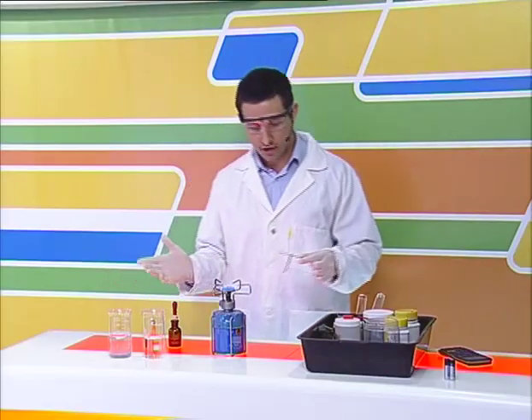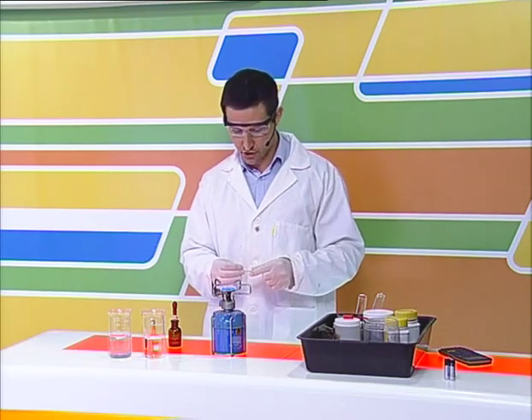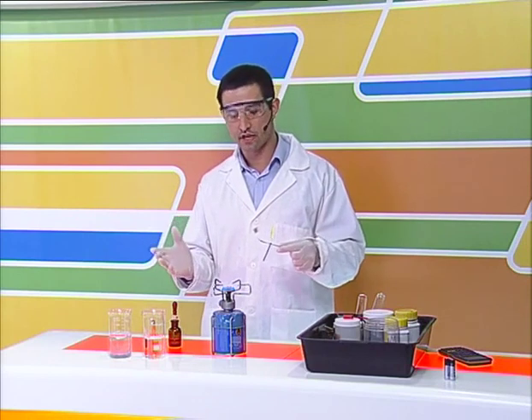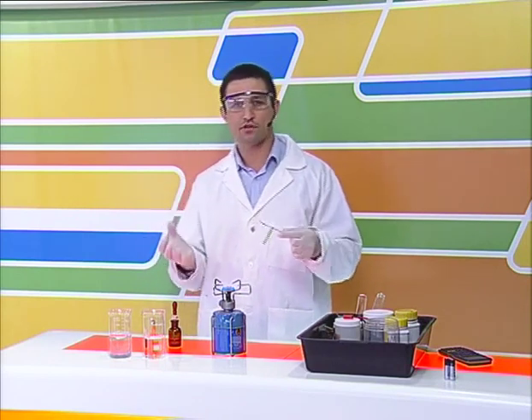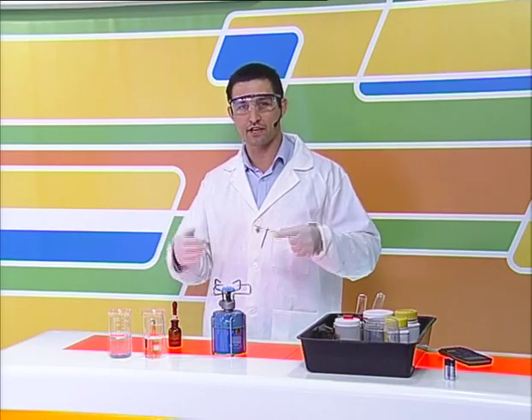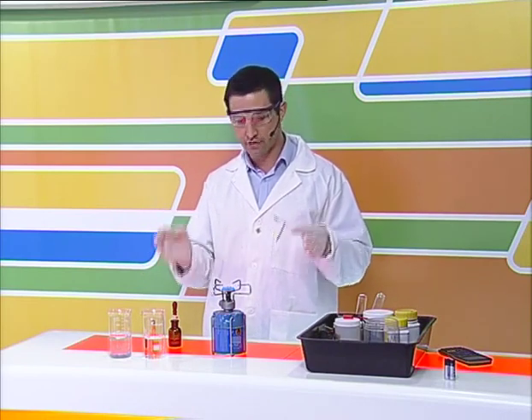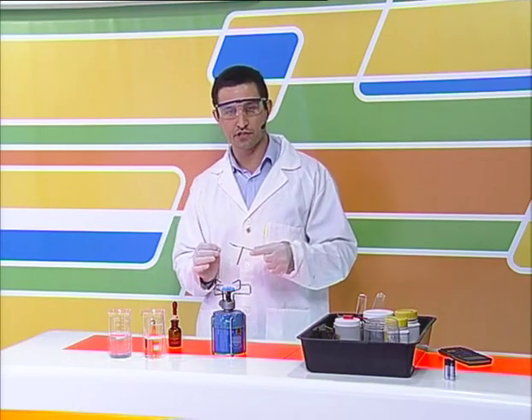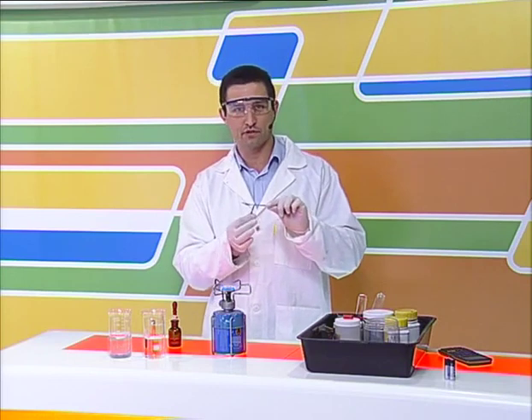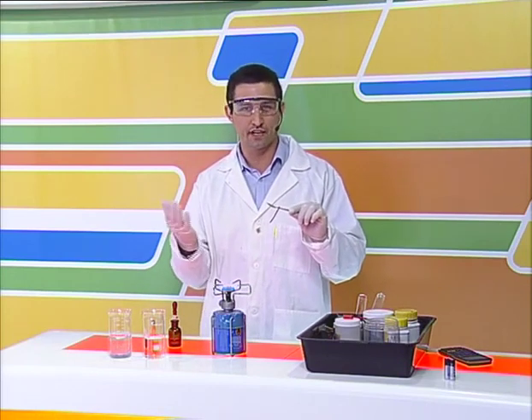Thank you, Ty. Okay, well, one of the first things that I wanted to show people, and I wanted to make sure that people actually understand why we're doing this, is because we need to know how redox happens, and we need to see some evidence of it. And tonight we're going to be taking a look at some electrochemical reactions. Now, the first one which I'm actually going to show you is probably the simplest electrochemical reaction. It's a reaction with a metal, with a non-metal, which I'm actually breathing in at the moment.